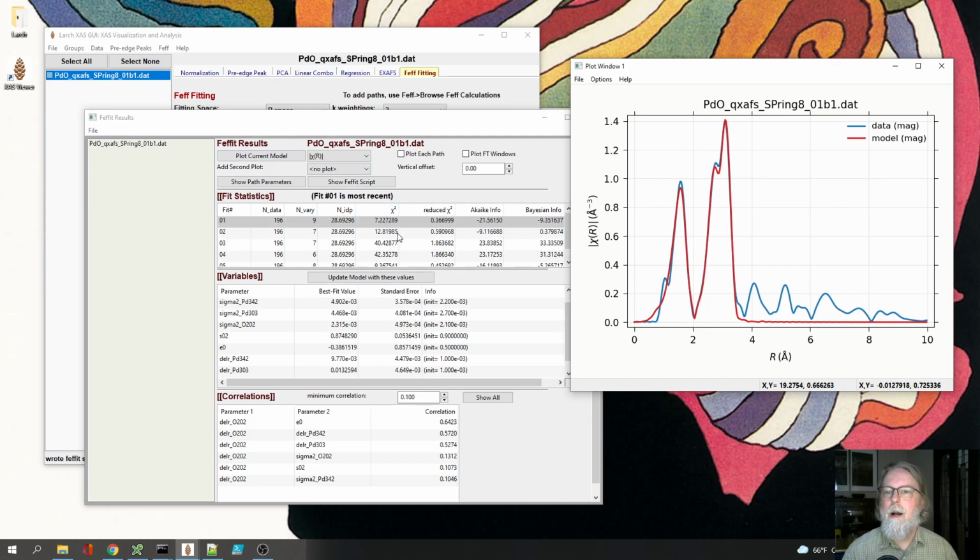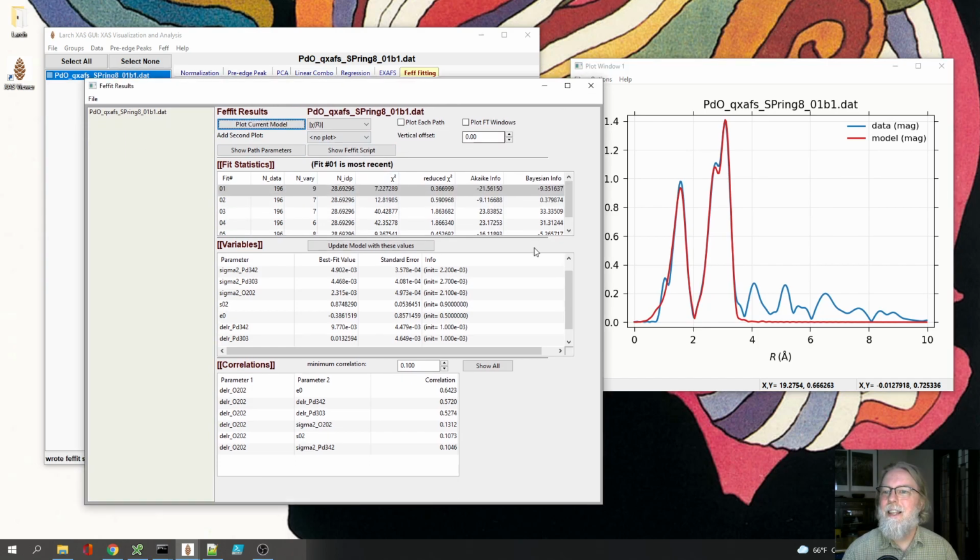But now we can compare the values for these parameters when we included the third cumulant. So first of all, we could look at the variable. The third cumulant we find to be 3 times 10 to the minus 4 plus or minus 1 times 10 to the minus 4. So that means that it's not quite consistent with 0. It's a small number, but it's also well constrained.